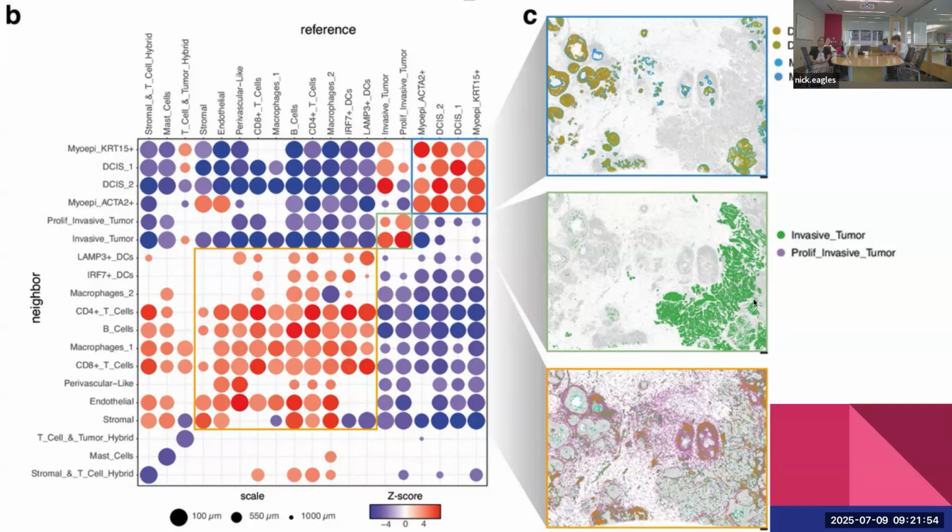You only see the invasive tumor cell type here. I was trying to find some of the purple here. It's a little bit harder to see, but I think that might be just because they're very interspersed based on the co-localization relationship. Hard to tell here. And there's an example of a huge number of cell types really. I didn't even show the colors here because there's so many of them, and I don't know if we would be able to individually interpret them, but you do see these interesting spatial patterns of small regions where you have the cell types mixing, at a pretty small spatial scale in most cases.